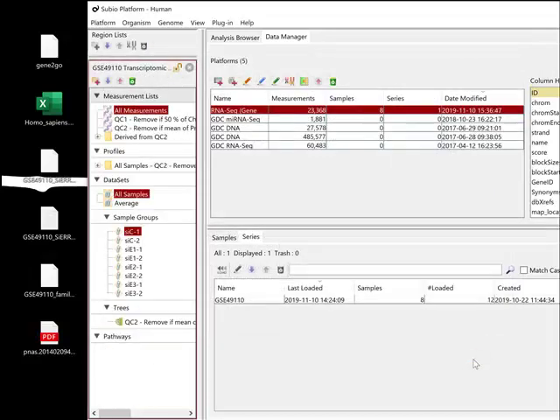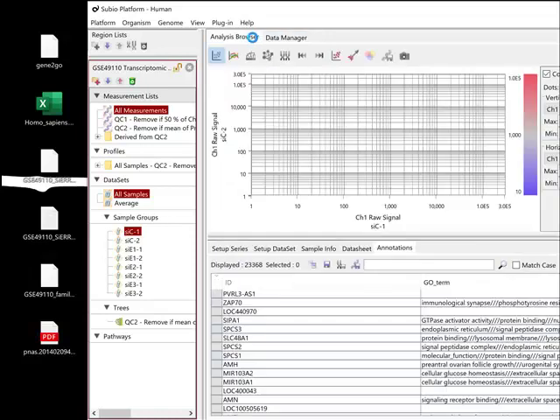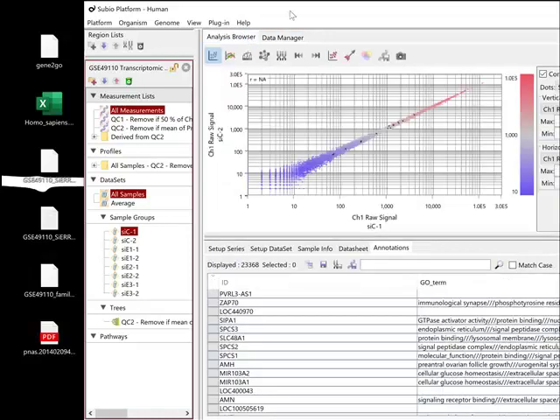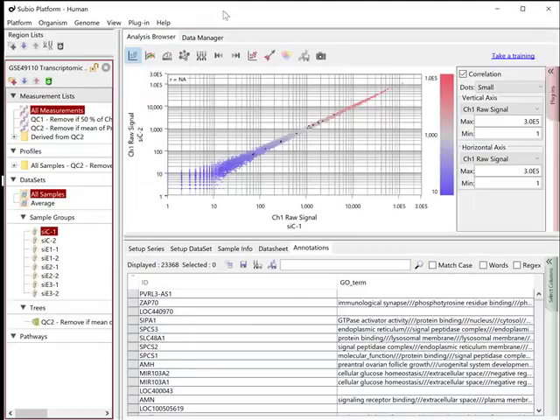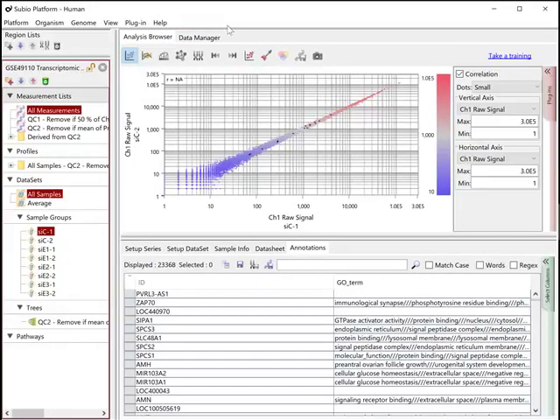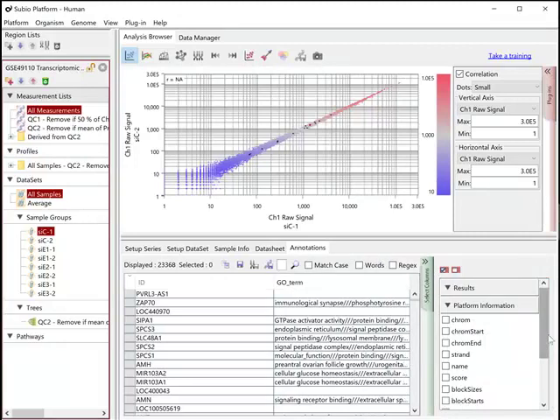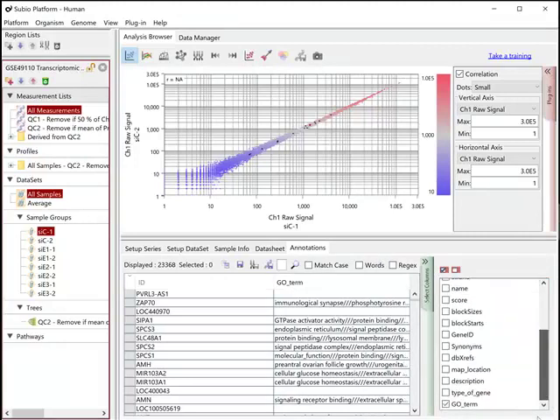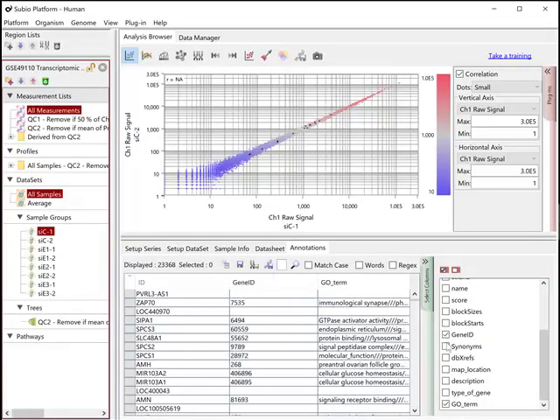You can access the imported gene annotation from the Annotations tab. You can choose columns to show in table arbitrarily.